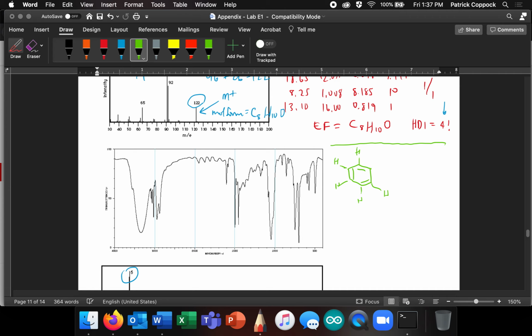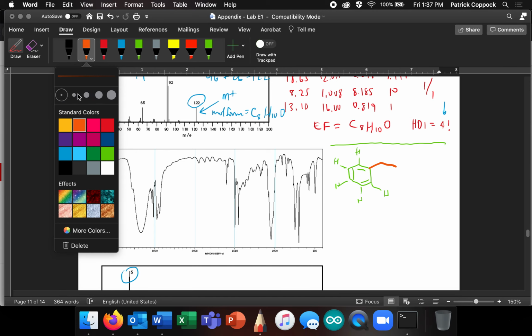that gives us, okay, let's leave it like that for now, and let me come in a different color. That means that we've got 2 carbons left, right? And this is going to be too good to be true. Let me go with that little thinner marker here. Okay, and an oxygen.